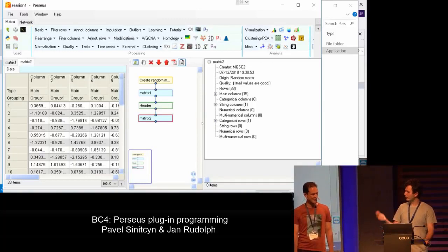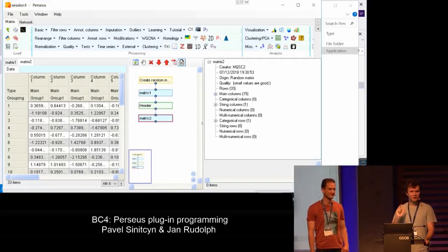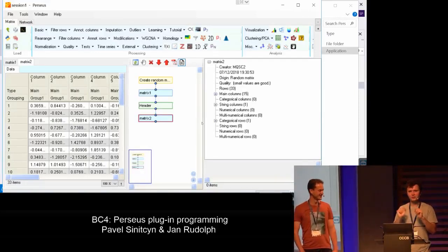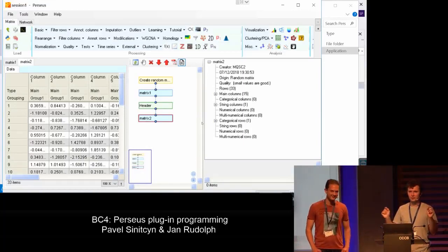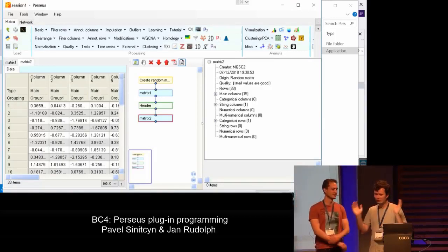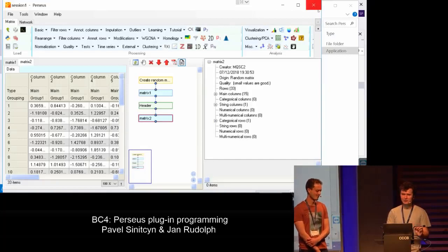And the third thing is that there are many ways to crash a plugin. So be careful with this and really think about all possible combinations. I wrote one parameter, and you saw there already were two ways to destroy our software plugin. But if you have a second parameter, a third parameter, the combination of these parameters can blow your mind and blow the Perseus plugin. So think about this carefully.